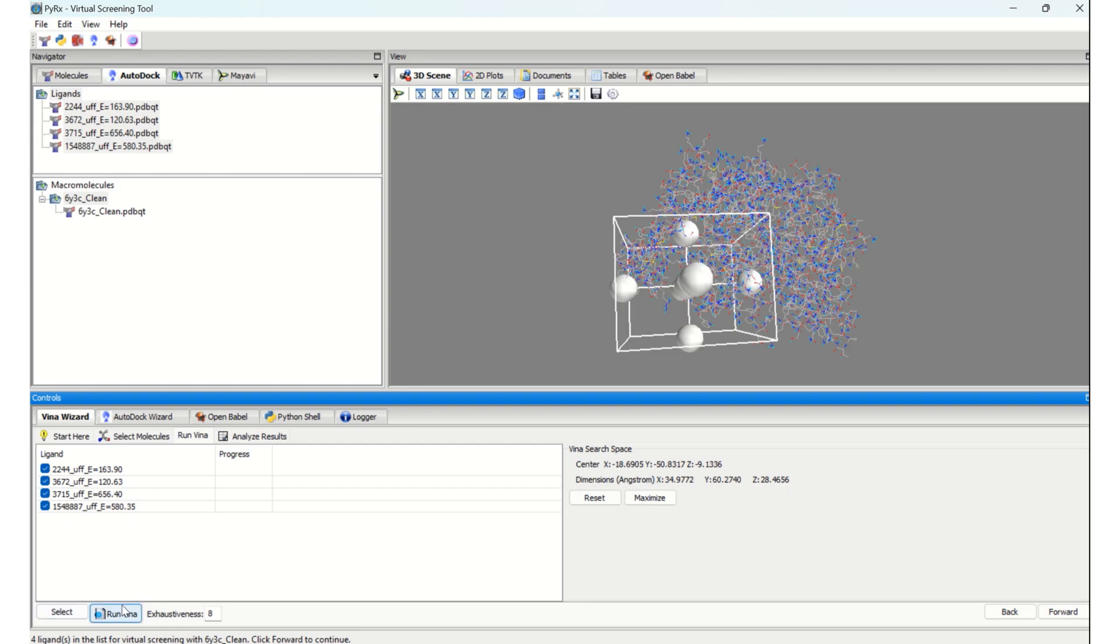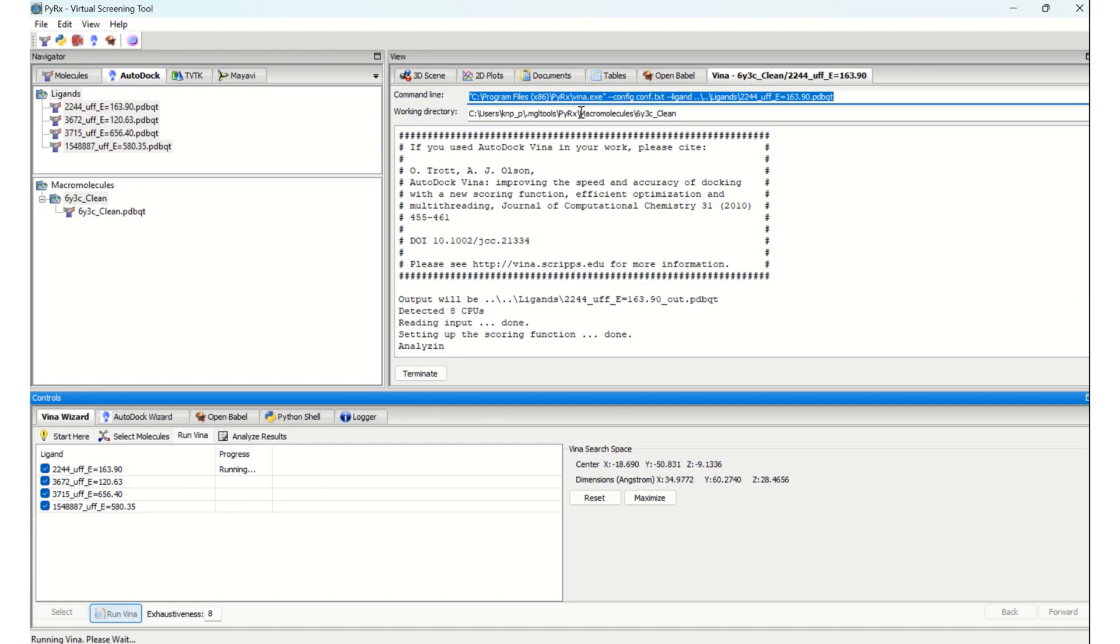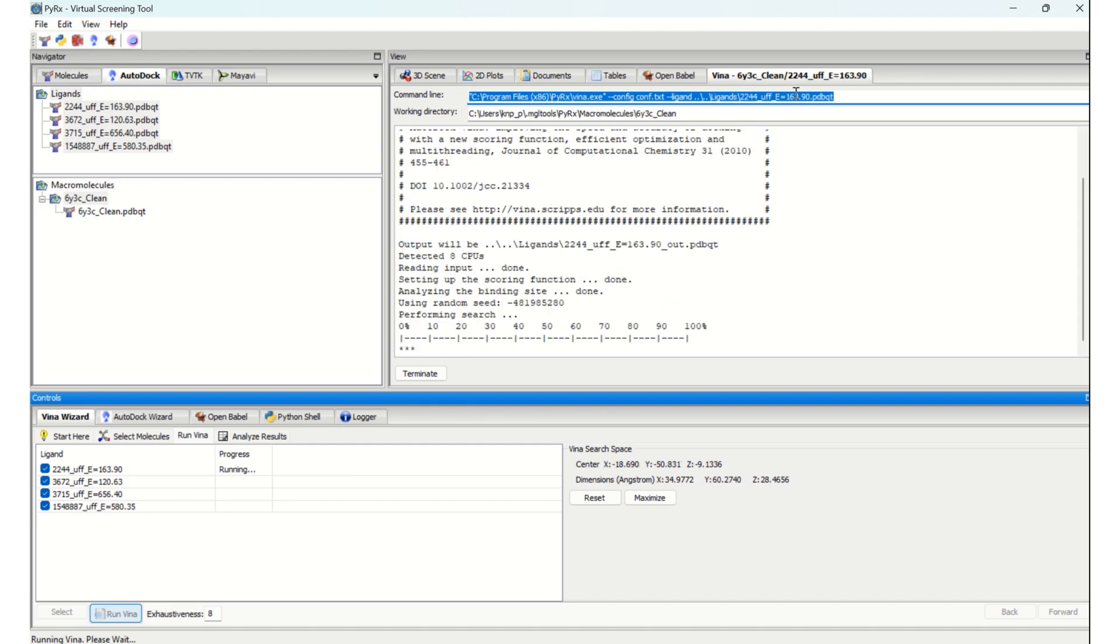By clicking here, you can see the command line has been generated automatically, which I mentioned in Part 1 where I discussed the advantages of PyRx. Here you can see the docking of the first ligand is running.